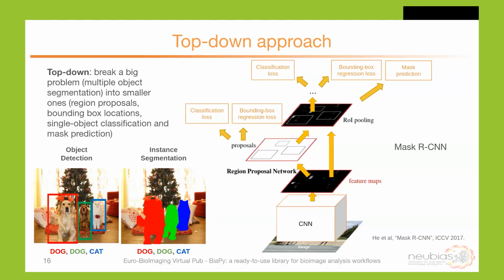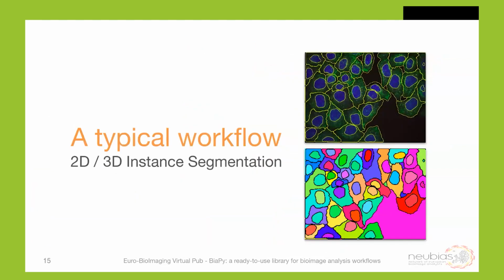I just want to know if all the models are based on existing pre-trained models like StarDist 3D or Cellpose, like you stated earlier, and also if we always need masks to use BiaPy. You always use masks, labels, I mean.